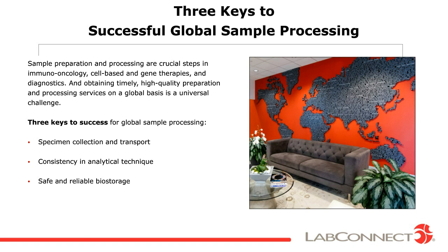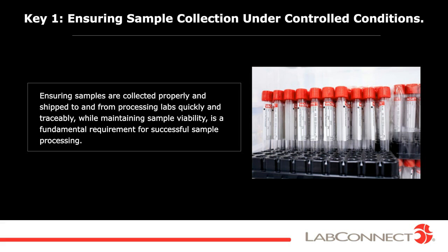Today we're going to talk about the 3 keys to success that Liz mentioned before in a sequential order, kind of going from the collection all the way through the storage of the samples. We're going to start off by looking at collection and shipping under controlled conditions.